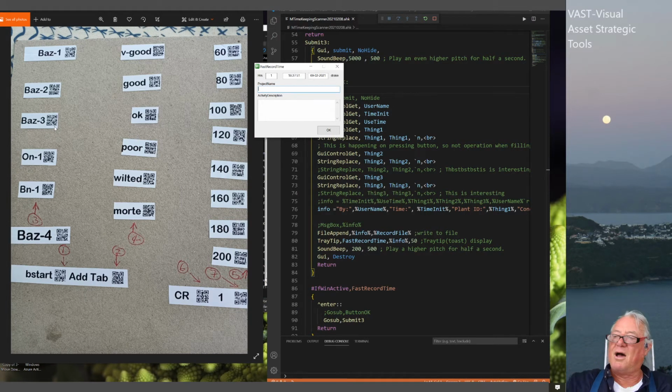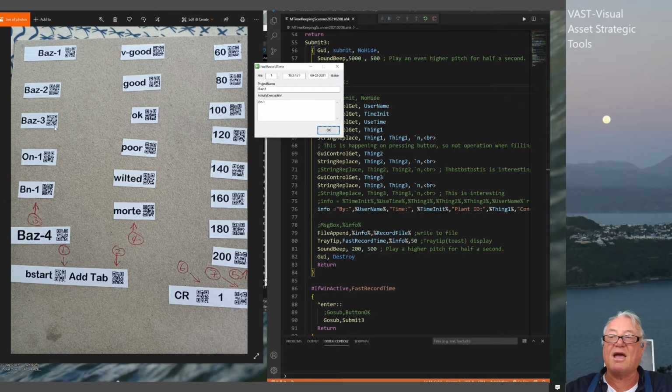So if I'm looking at the plant and I've got my card and I'm trying to scan something, how do I know that it's gone to the PC? I know it's gone to the scanner because the scanner's vibrated, but now it's dead, so at this point I've got to activate it. It makes a squeaky noise, which means it's now active, and if I send something to it, it will now scan. But it's totally silent. If I do something else, it's chunking all the way through and doing other things. But the PC's behind me.